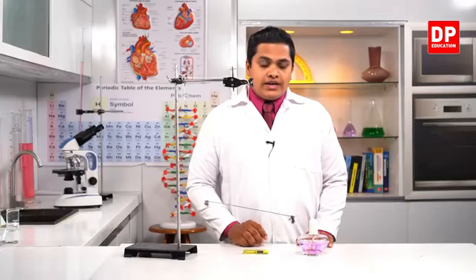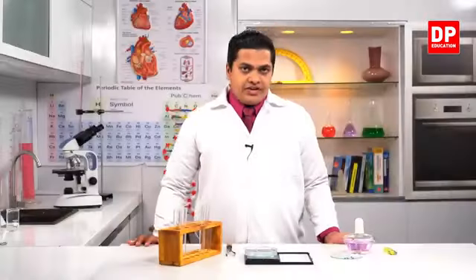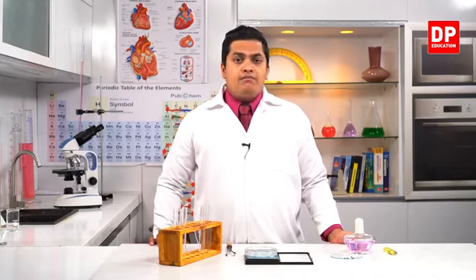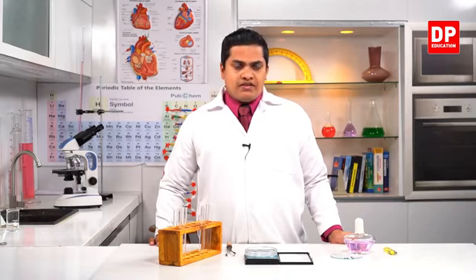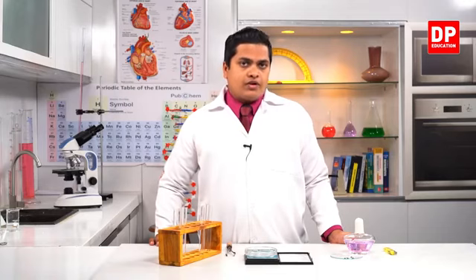That's why this rod is not in a balanced horizontal situation. So my dear children, in the earlier activity, we discussed that during the burning of iron wool, mass has increased. Now I am about to conduct another activity to see whether there is a change in the mass during a chemical reaction or chemical change or not.